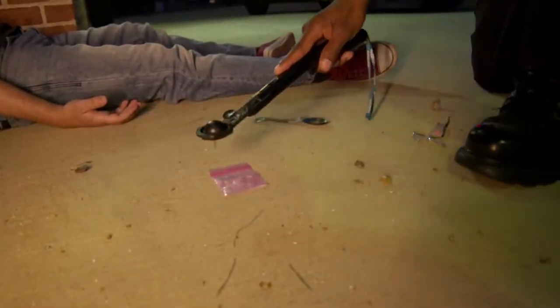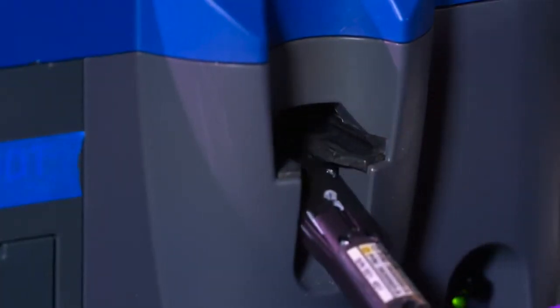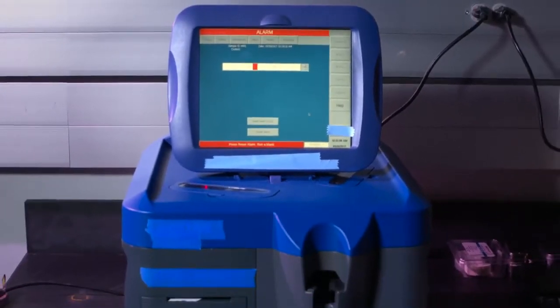Our goal in this research was to provide a mechanism for law enforcement to determine in the field, without having to open bags and sample directly from bulk powders, that they actually have fentanyl or one of its analogs in the material. We're looking at two different techniques: ion mobility spectrometry, which is more of a field-based screening technology, so something that police officers could potentially have in the back of a cop car or a crime scene van.